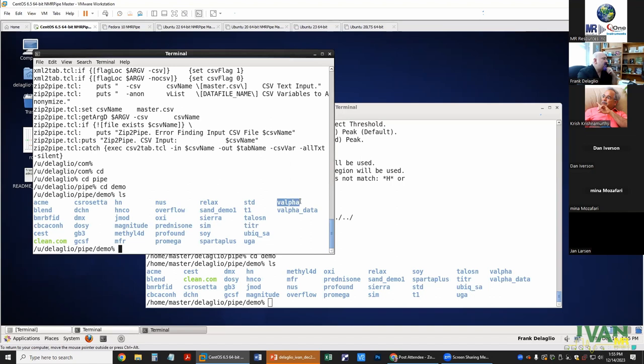related triple resonance spectra as would be used in sequential assignment. And we saw those too. So the thing to do is to look through these examples and match them to what you have in mind. And if you don't find the example that you want, the next thing to do is to write to me and ask about it.